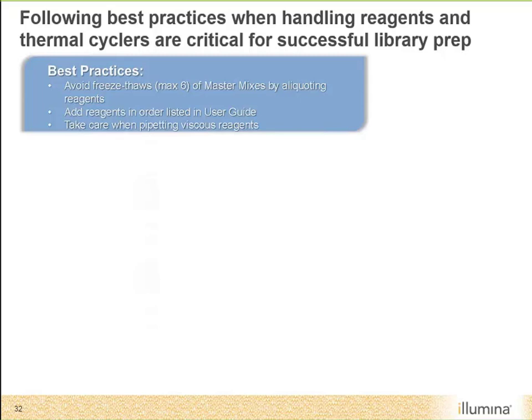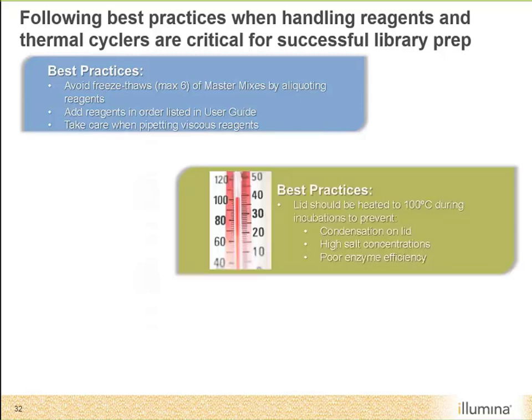Another key component is that we want to make sure that we're adding the reagents in the order that is listed in the user guide. I know from my time in the lab, if I could do a premix, I would. In this case, I definitely recommend following the order that is listed in the user guide. And there are some reagents that can be a little bit viscous within the workflow, so we just want to take care and pipette viscous reagents properly. Be a little bit patient as you're trying to pipette those very viscous reagents.